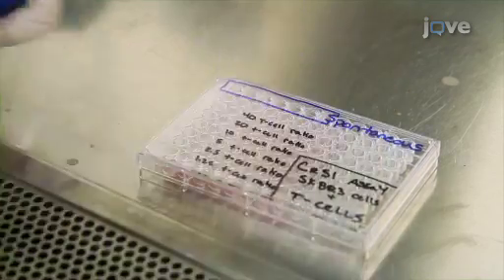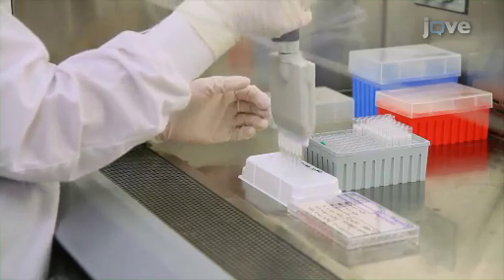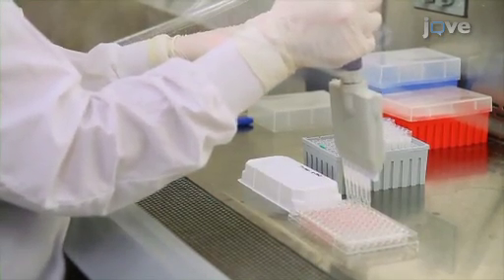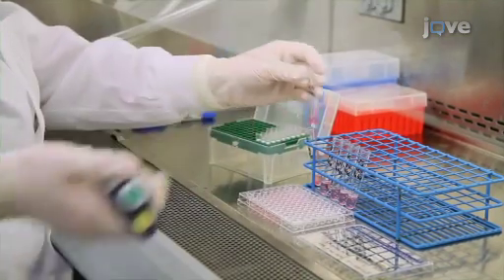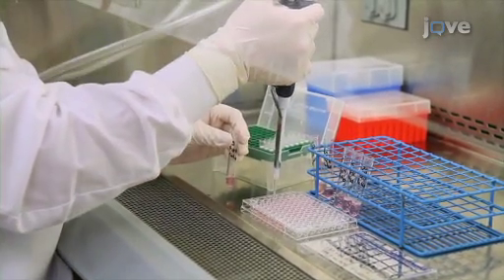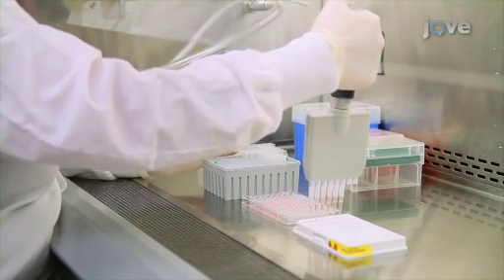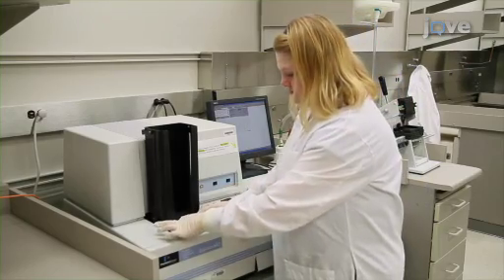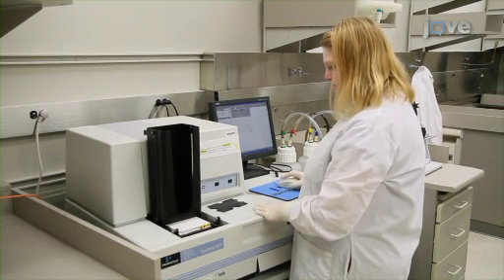To calculate spontaneous release, do not add anything else to 6 of these wells. To 6 other wells, add 100 microliters of Triton X-100 to lyse the cells and hence calculate maximum release. To all the remaining wells, add T-cells to the plate using the dilution series prepared previously. Now incubate the plates for 5 hours and collect 50-microliter samples of supernatant from each well. Load the samples onto a luma plate. After drying the plates in the hood overnight at room temperature, measure their CPM using a gamma counter.